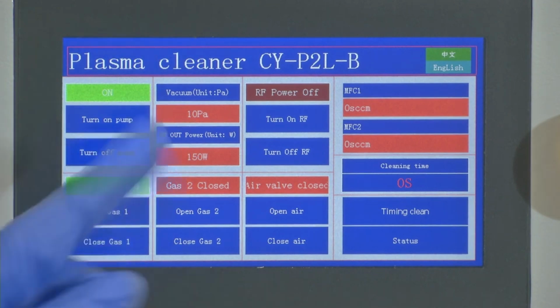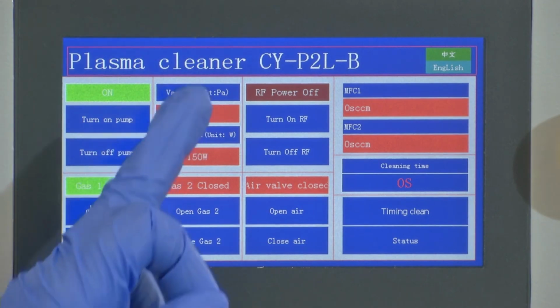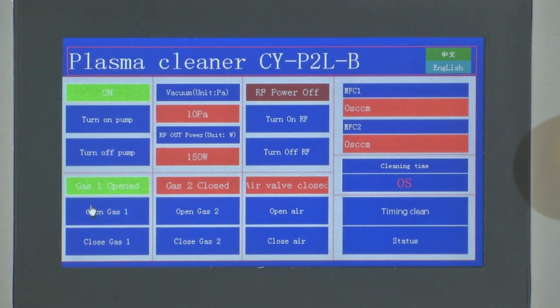So we have pushed oxygen inside. You can see the pressure slightly increasing. It has become 22-23 Pascals. I will not keep it that high, I will reduce it a little bit. We will keep it to 15 Pascals.